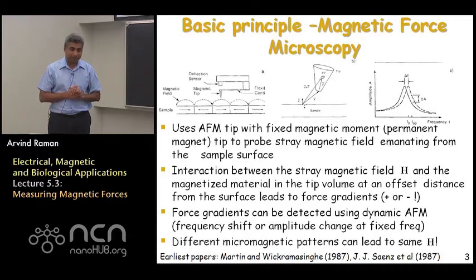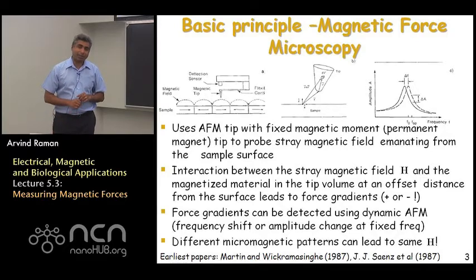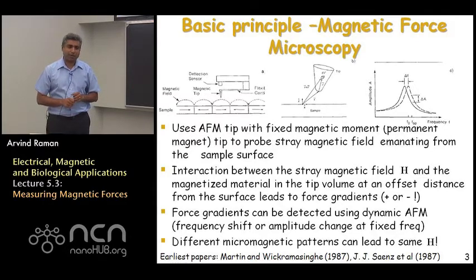Now, in this particular lecture today, we're not going to go into details of how to model this interaction. This is provided in much more detail in the references at the end, in the appendix. I would also finally like to point out that magnetic force microscopy was perhaps one of the earliest implementations of dynamic AFM that have been known. In fact, the very first papers that came out on this subject were in 1987, 1 year after the invention of the atomic force microscope. So that's something to keep in mind.